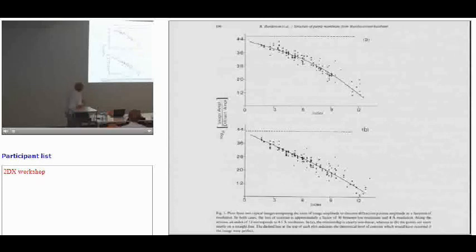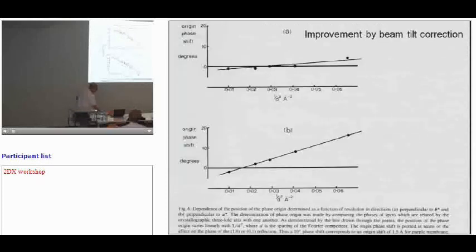And you can see it's not a straight line. This one curves down, this one's nearer to straight. But we're plotting it against resolution and not resolution squared. And typically in X-ray crystallography, for thermal disorder, you should be plotting this against resolution squared for a log curve to be linear. And if you do that, it actually curves upwards. So there's something about these images. Probably they contain a high resolution component that goes out to high resolution, and then there's more at low resolution that's sort of separate. So it isn't behaving as a single Gaussian. It's more complicated than that. But it's interesting and useful to do that because it tells you something about what you're doing.